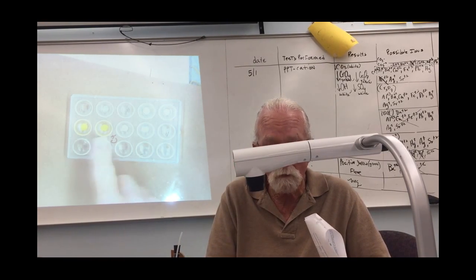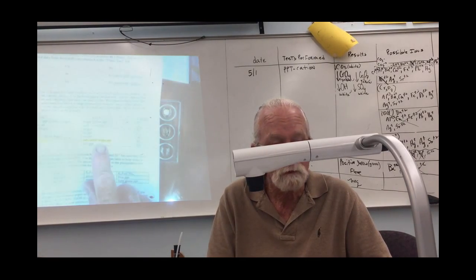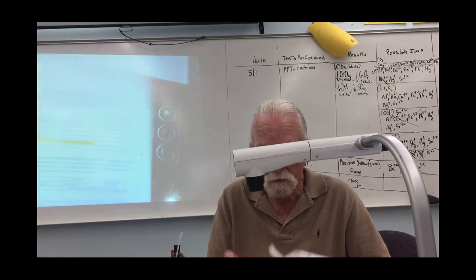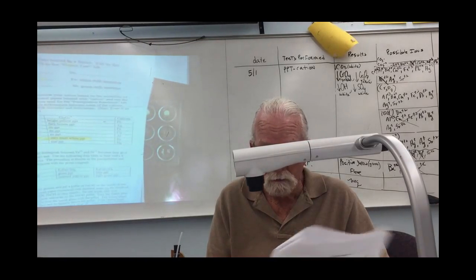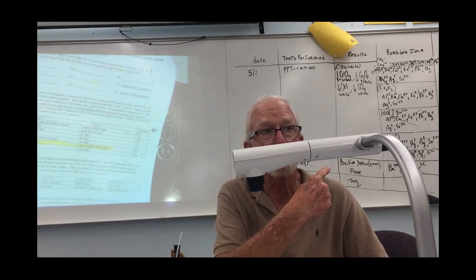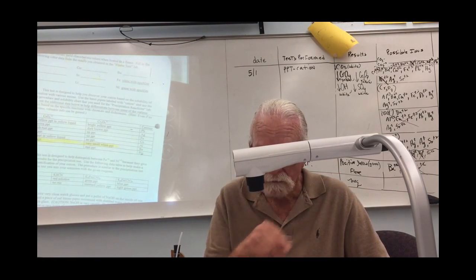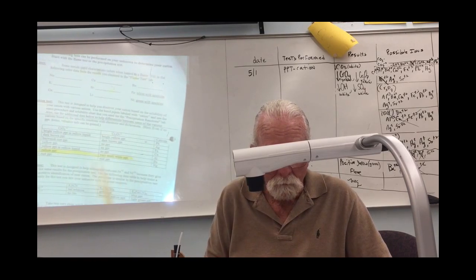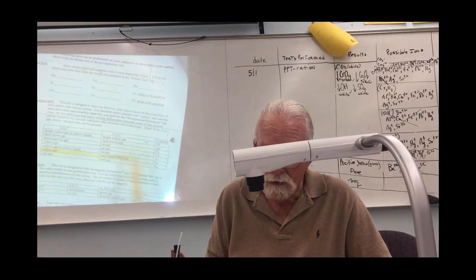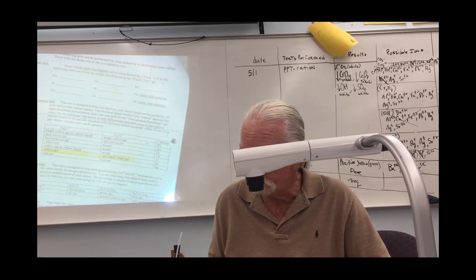That is orange with a white precipitate in it, which matches this. It's hard to see, but it does. All right, and then it's white and white here. So barium's still a possibility, isn't it? All right, what else? What's the next one? Lead. Look at lead. Yellow, yellow. Could be, couldn't it? So lead's still a possibility.